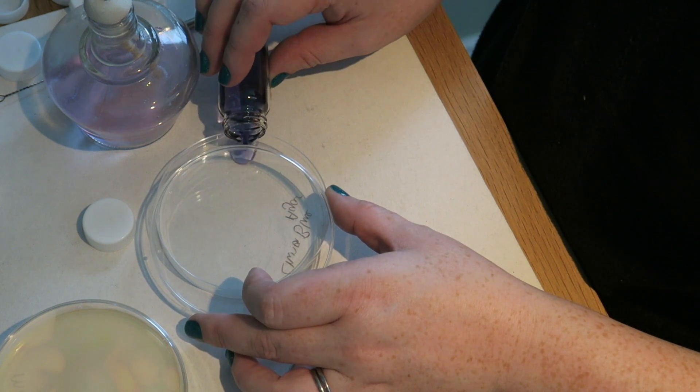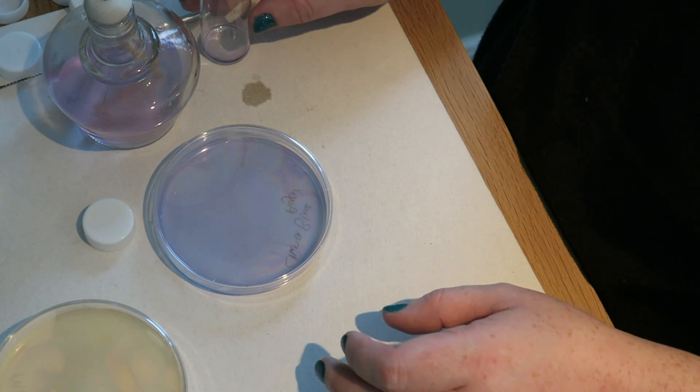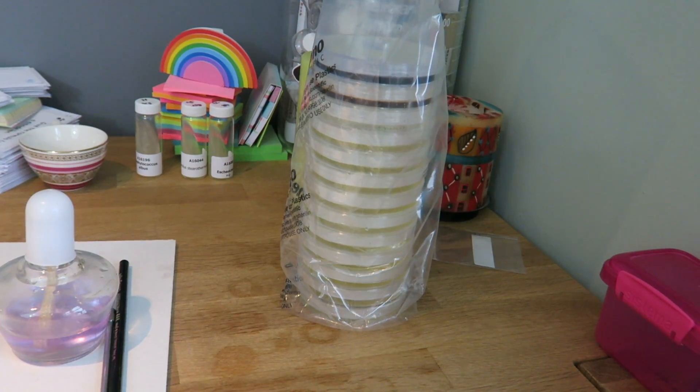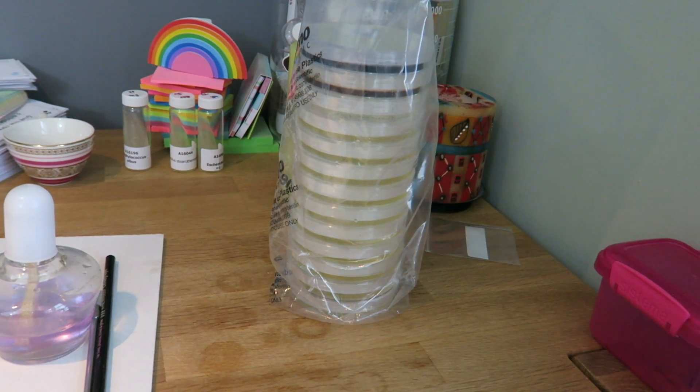If you want to take the lid off as little as possible to pour it in, and generally when it just about covers, that is enough to put in. When you're finished pouring, you can put the bag back over the top and leave them like that until they are set.